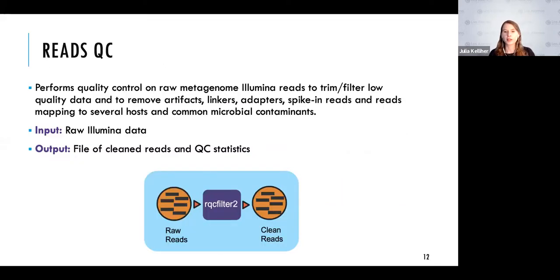The READS QC workflow, so also, like I said, there are several NMDC EDGE and LANL workflow developers on the call. So if you have more specific questions that are more in depth than I am able to answer, they would be happy to answer those questions for you too. So feel free to put them in the chat or into the shared notes doc.